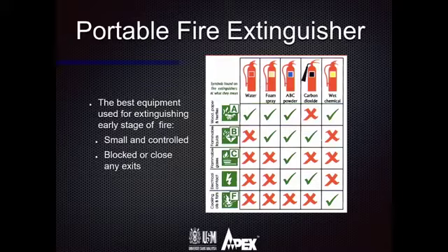Also, we need to understand that in close proximity or in a room, fire extinguishers will do their job very well. But again, it is imperative that the people who are going to use the fire extinguisher are trained and well versed in using fire extinguishers.